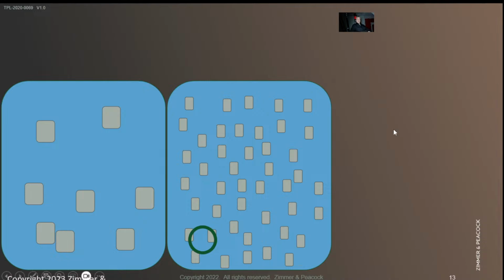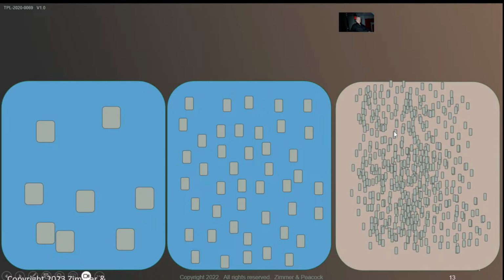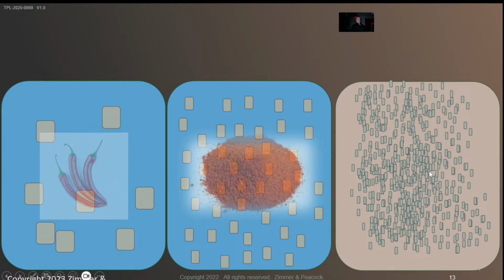sample, and then if I go to a more homogeneous sample, if I sample here, I hit about 13. If I sample here, I hit about 13, and I sample here and I hit about 13. So this tells you that if you're trying to sample on Tabasco sauce, for example, then it doesn't matter where you sample, the whole thing is quite homogeneous. But when you are dealing with chili powders, it actually becomes more important that one sample is not going to be representative of the entire chili powder, and I think this is at the heart of what's happening.